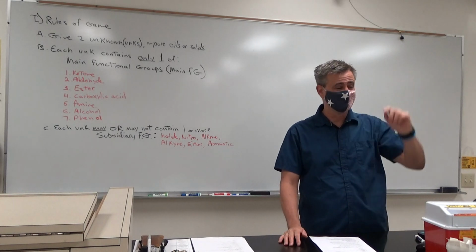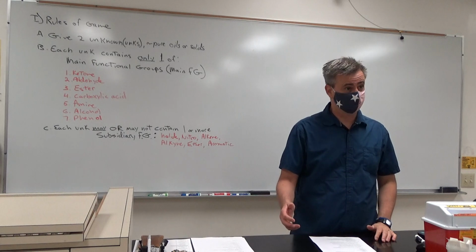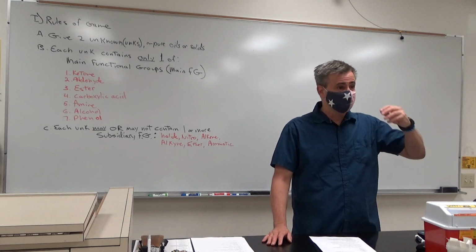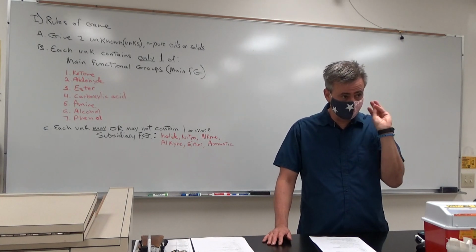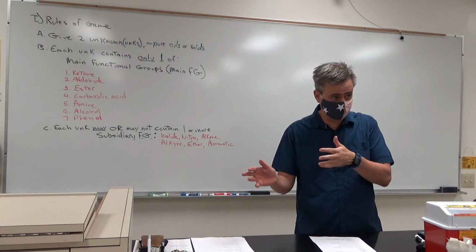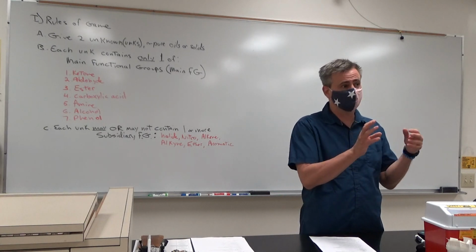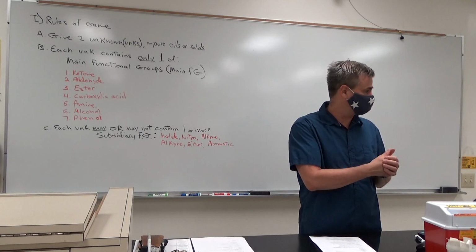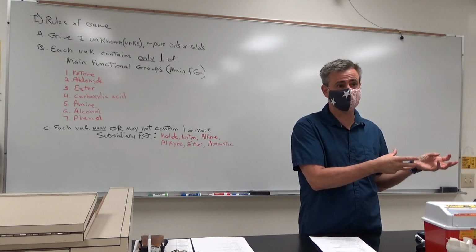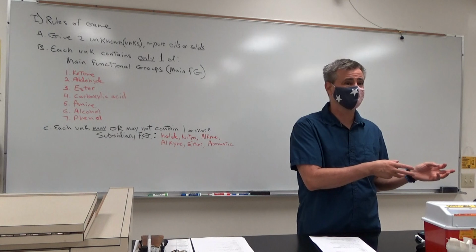So maybe it funnels you all the way to a phenol. Then you're working on the premise that you have a phenol. You only want to do qualitative tests that are appropriate for the phenol. Don't do a nitrous acid test on something that you think is a phenol. Nitrous acid test is for amines.